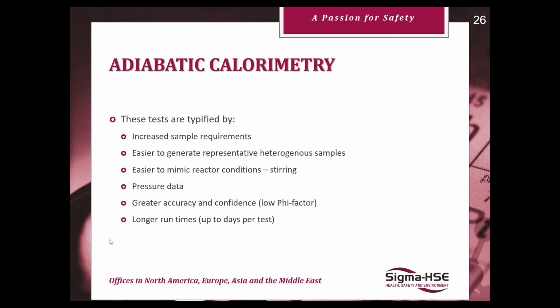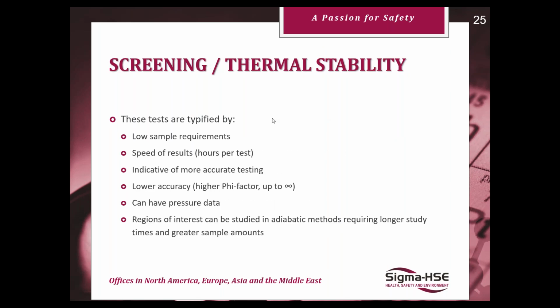Screening thermal stability tests are typified by low sample requirements, specifically for the DSC testing, and speed of results. That's why we categorize them as screening tests, especially in some R&D labs within companies.